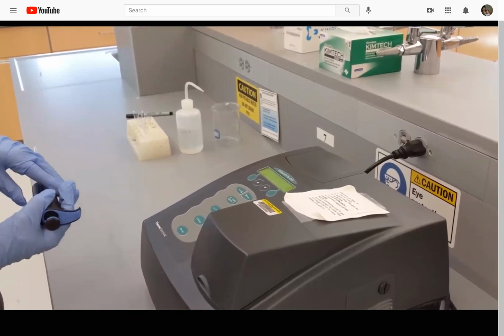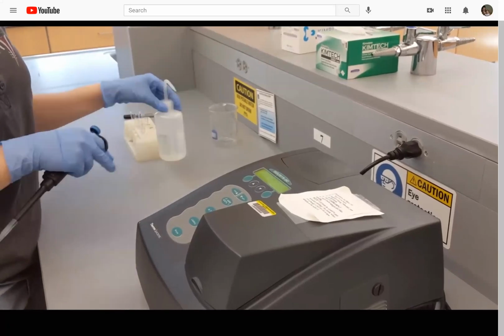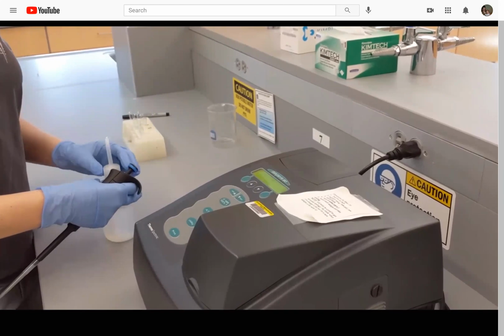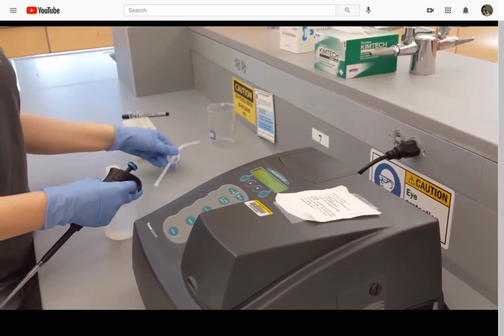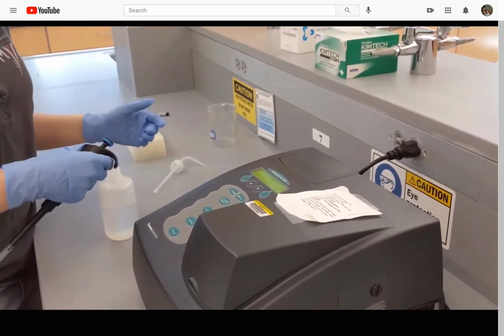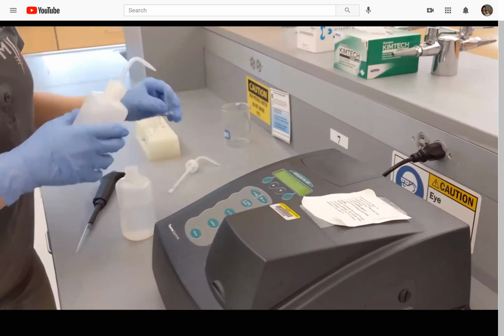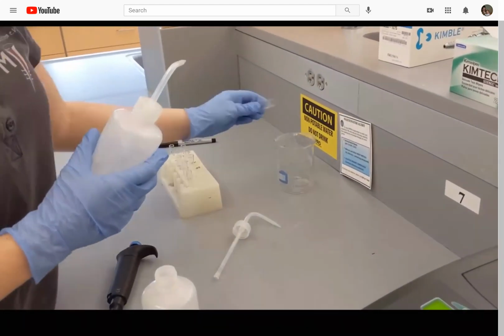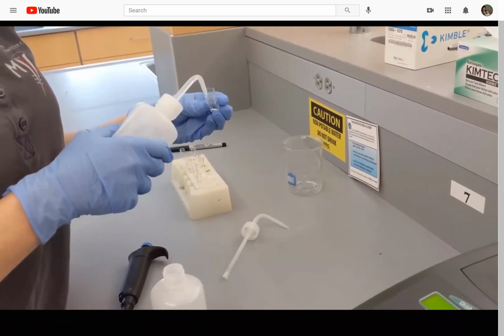The next thing that I'm going to do is measure the lower limit of quantification, I believe. Yes. So we're going to do this by measuring the absorbance of a clean cuvette with DI water. So first I'm going to rinse my cuvette several times with DI water to make sure there's no residue in there.